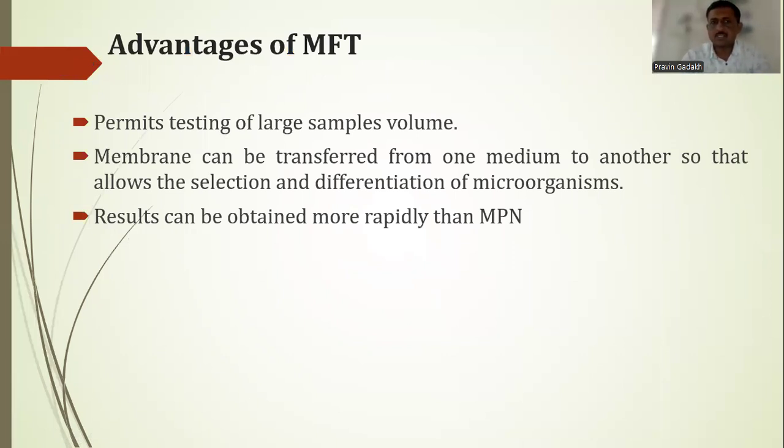Now we can discuss the different advantages of the membrane filter technique. A large volume of water sample can be examined by means of the membrane filter technique. Hence, it is possible to detect even a few index organisms, or in the case of coliforms, organisms or pathogens in a large volume. It also permits testing of a large number of water samples.